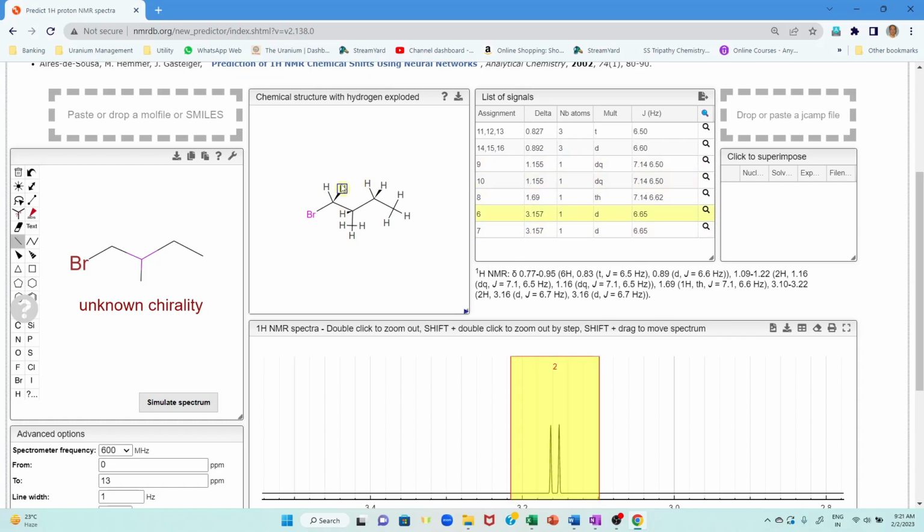You can't believe that geminal coupling constant will be as low as 6.65. And so also the vicinal coupling constant in other peak patterns will be 6.6, 6.5. So this is unacceptable. This should be DD. Oh yes, you cannot distinguish between the 2 geminal protons. You are not going to give the different shift values. Give 1, but you can't say it is D. It is DD.